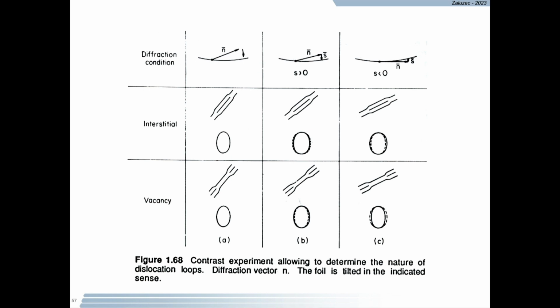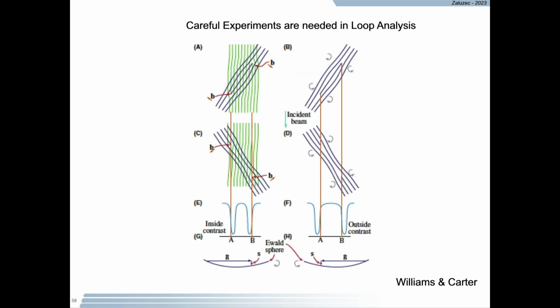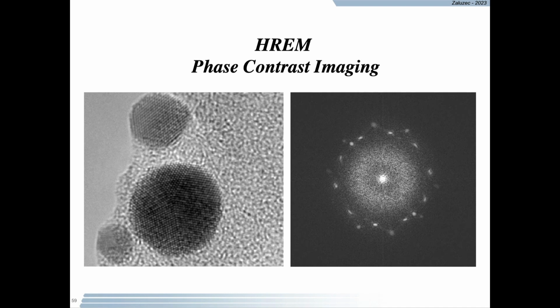We won't be talking much about that now because we don't have time for it today. All right. I'm going to leave that brief introduction to diffraction contrast and shift to phase contrast. The reason I want to do that is the instrument you have here has an aberration corrector, and it will get you relatively high image resolution.